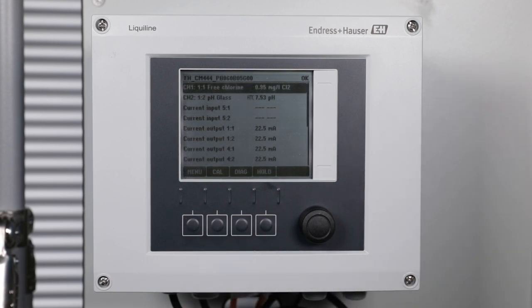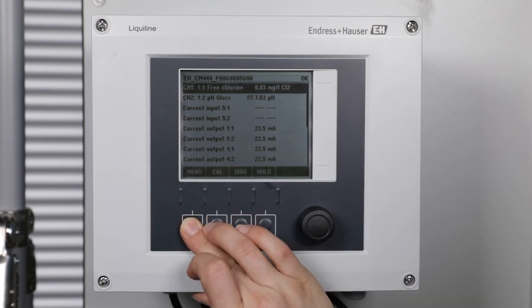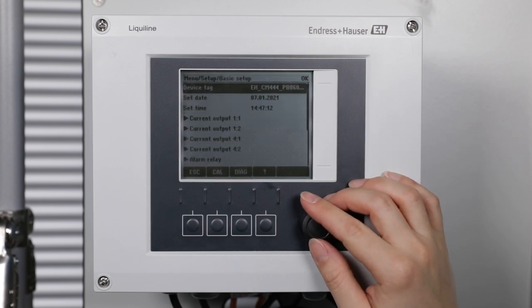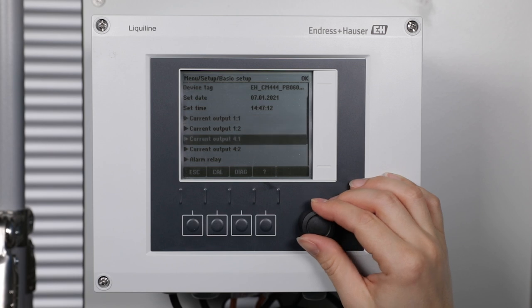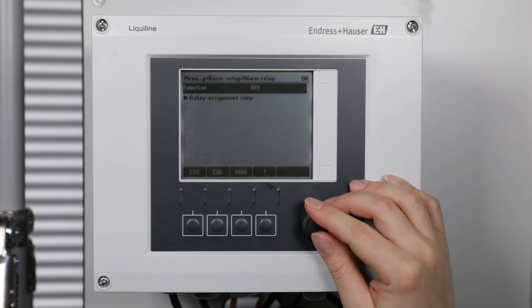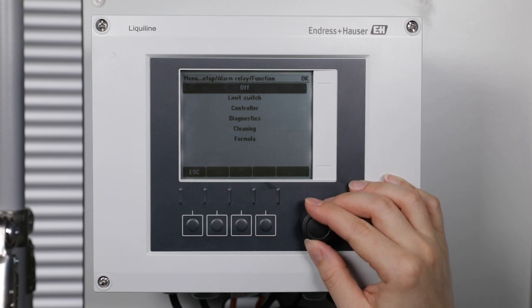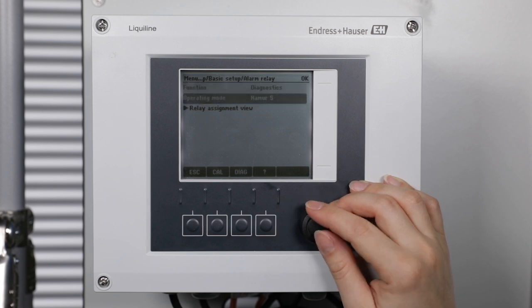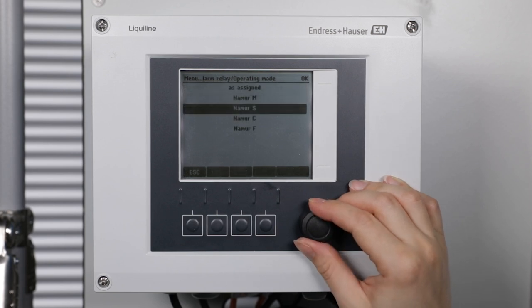Now the relay for the status indication light needs to be activated. When using the alarm relay, please check if the alarm relay has already been activated. In menu, setup, basic setup, alarm relay, its function needs to be turned on. It is a diagnostic function with operating mode NAMUA-F.